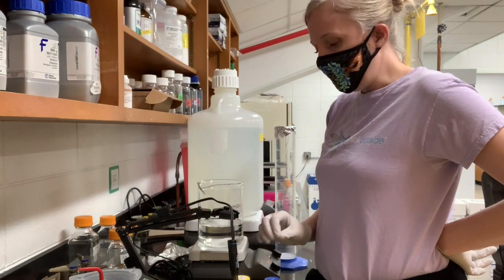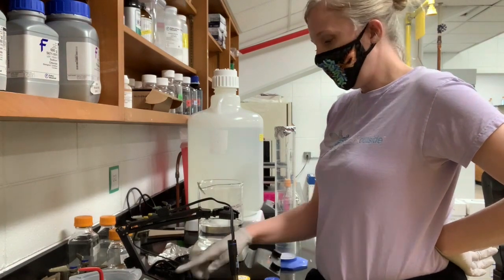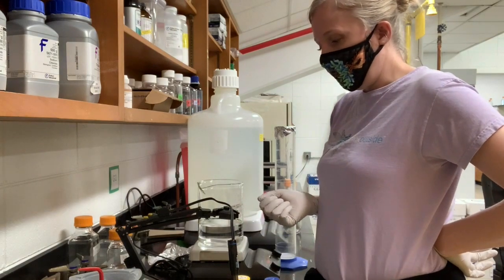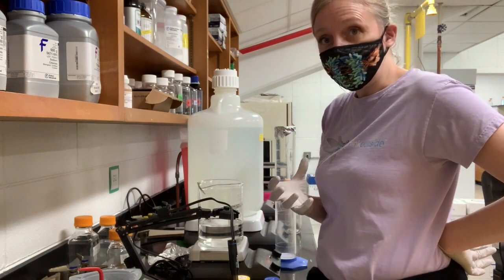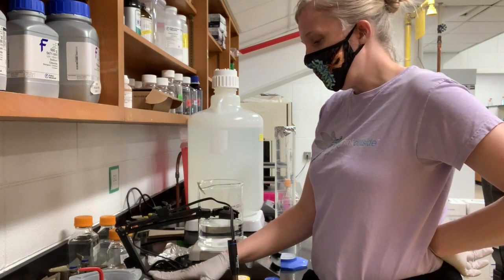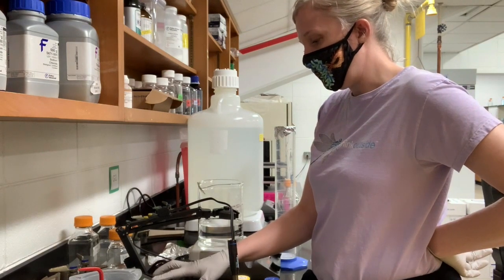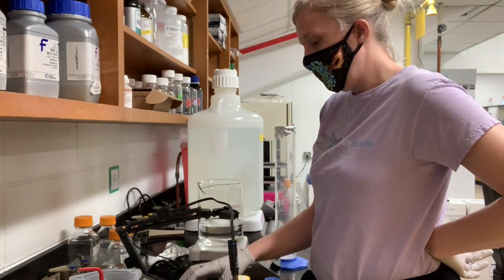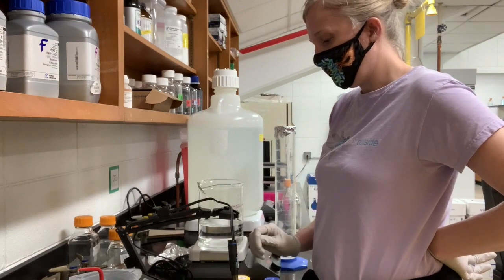And this should be pH 7, and what's blinking is 7.01, so it's very close. It was already pretty calibrated. Once there's a stable reading from the meter, the machine will say reading is stable, accept or enter buffer value, and you will hit accept.